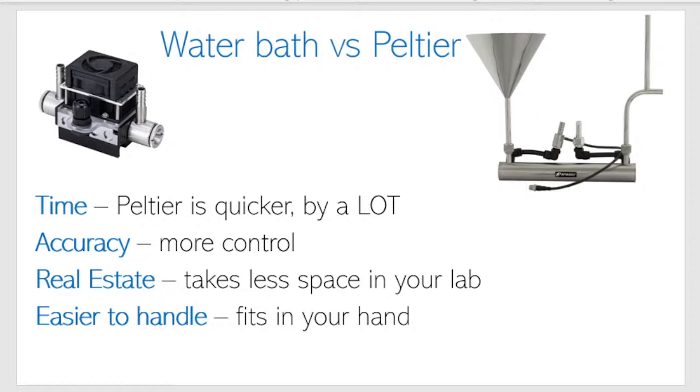And then you have to see what the temperature is at the polarimeter, and if it's not the desired temperature, let's say you walk in, turn on the water bath at 20, and hook it up to your polarimeter. After 20 or 30 minutes, you see that the polarimeter's temperature is 19.5, even though your water bath is 20.0. So you have to adjust your water bath by about 0.5 so that the water getting to the polarimeter is 20.